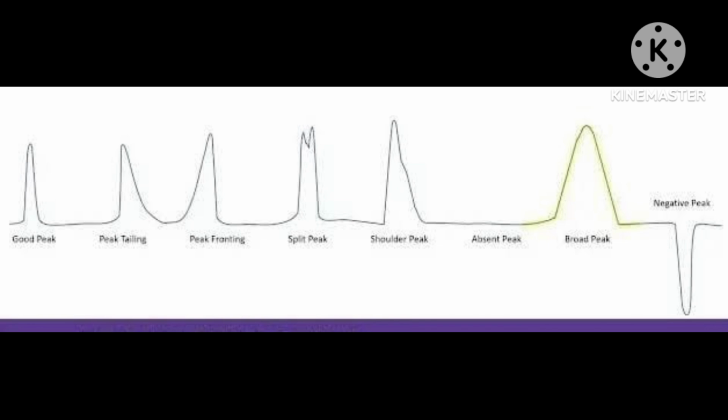System related issues like dead volume. The diameter of the capillary between the column and the detector can have a large influence on peak width. Dirty inline filters, frits, capillaries or injectors can also be a problem. This can lead to the broadening of peaks.